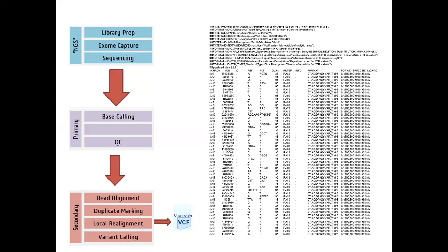Okay, got it, ma'am. But these are free tools, though there are also software provided by the company. It depends on you. Ion Torrent provides their own software, that is my understanding. So you can use their software, or you can use some free software as well, in combination. So till VCF, the process is the same.